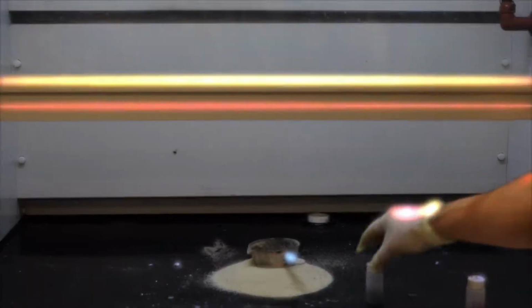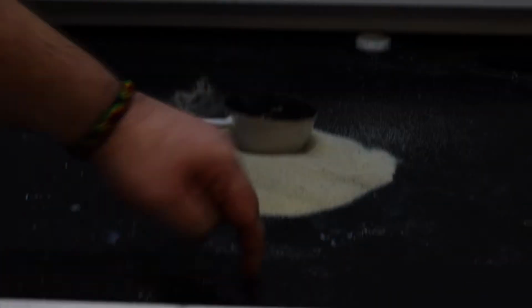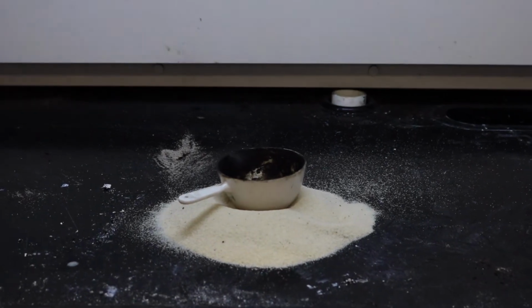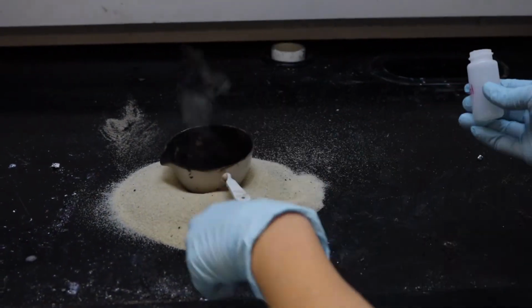Yeah, Alex. This reaction is one between potassium permanganate and glycerin. Potassium permanganate is a dark purple solid that is used as a very powerful oxidizing agent. An oxidizing agent is a substance which adds molecular oxygen to a compound. The molecular addition of oxygen is often a very exothermic process which produces a purple flame as shown here.